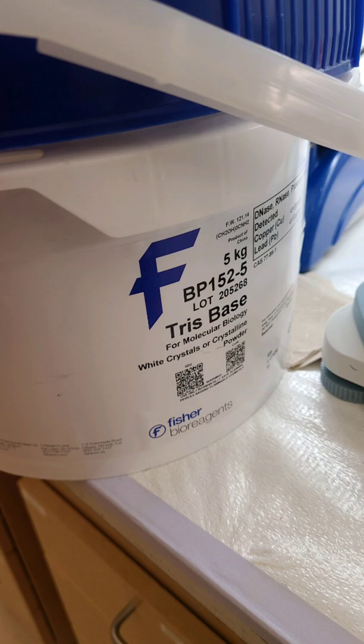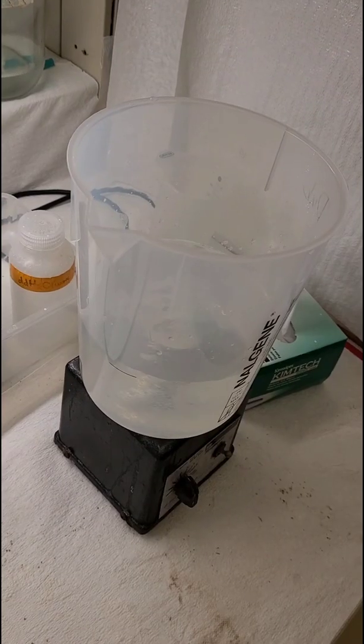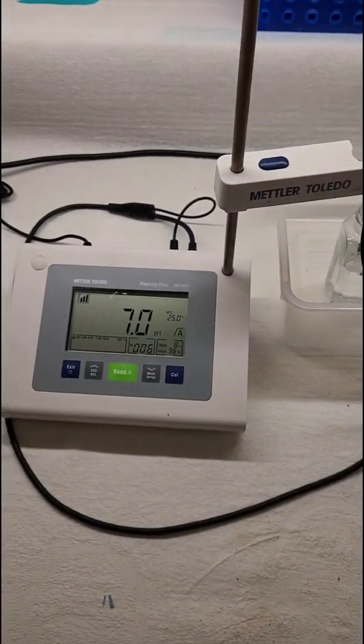To make Tris-HCl it's pretty basic — you need Tris base. I need 121 grams of it and then I mix it into 800 milliliters of water. That is now mixing together, which is pretty cool, and I have to bring it to a pH of 7.5.